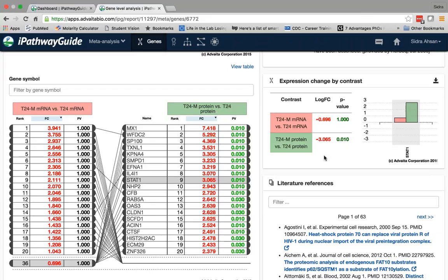So really quickly, I was able to generate a hypothesis that I can further study in lab, if I wanted to look at why the mRNA levels don't exactly correlate with protein levels, even though they're both upregulated.